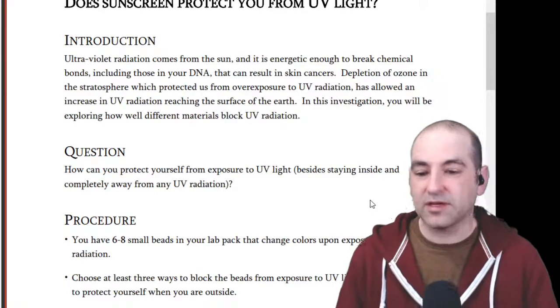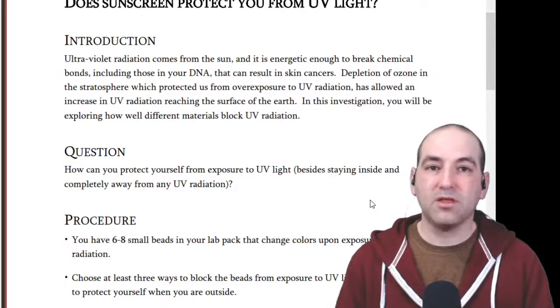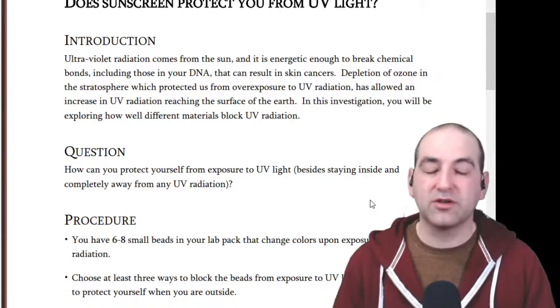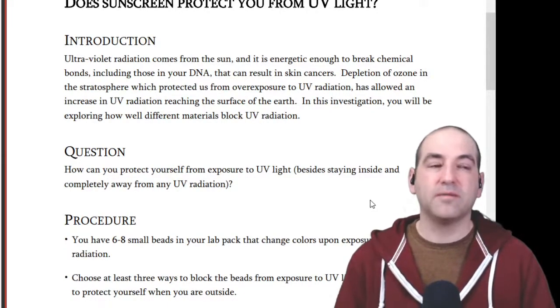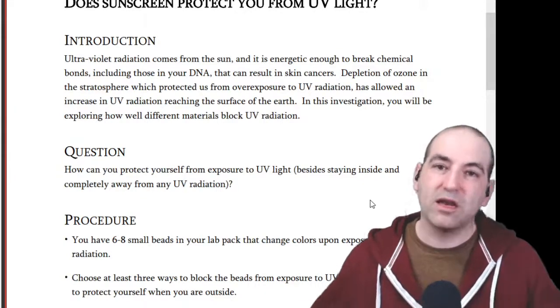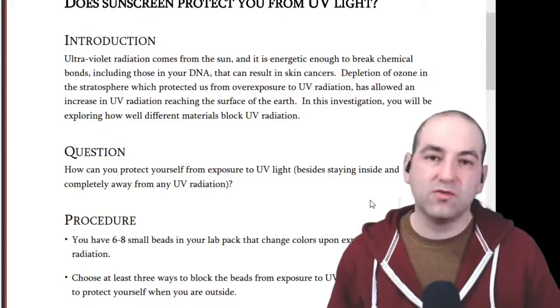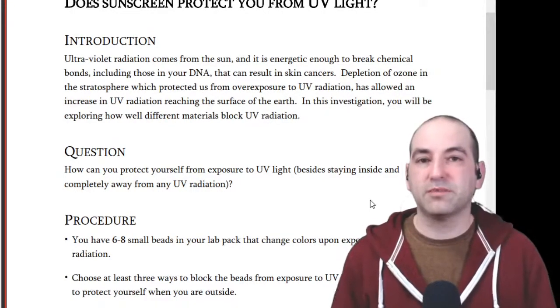Your blocking things could be things like different sunscreens. They could be fabrics, different kinds of clothing, even something hard, a piece of metal if you've got it, or plastic. So you can get a sense of how UV light penetrates through different types of materials.